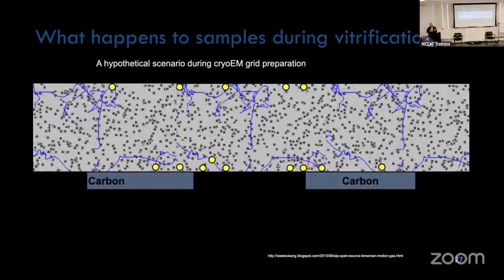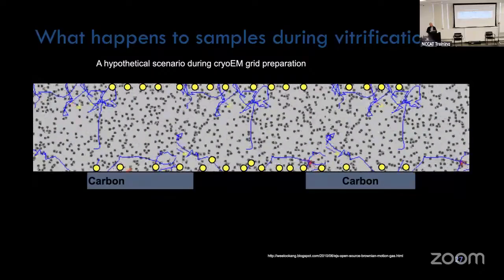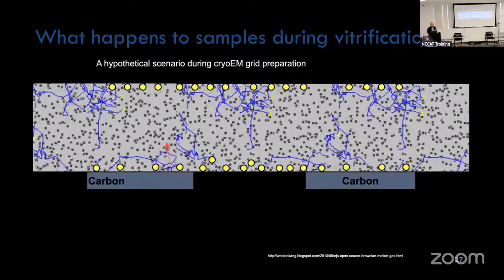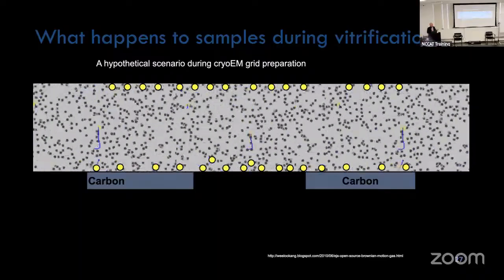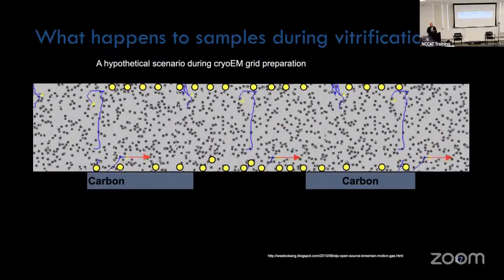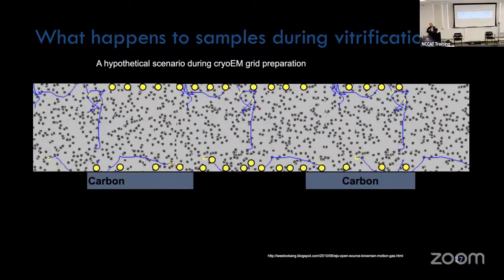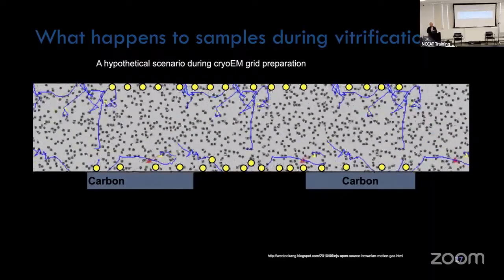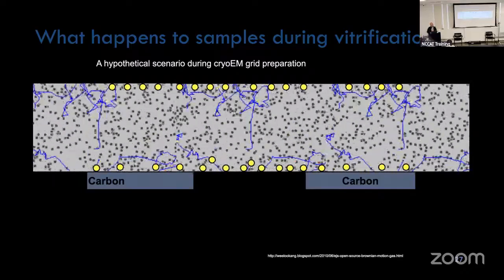And what ends up happening is then you have your macromolecule in solution, and it's going to bump into what's known as an air-water interface. And in that air-water interface, some deleterious effects can happen, for example, denaturation. There are some advantages like concentration. Something that you might notice is that if you're doing negative stain, you might only need a few micrograms per mil. When you're doing cryo, you might need quite a few mgs per mil. And when you're doing bulk freezing and then you mill a bulk solution, you might need hundreds of mgs per mil. And so there are good effects and bad effects of the air-water interface.